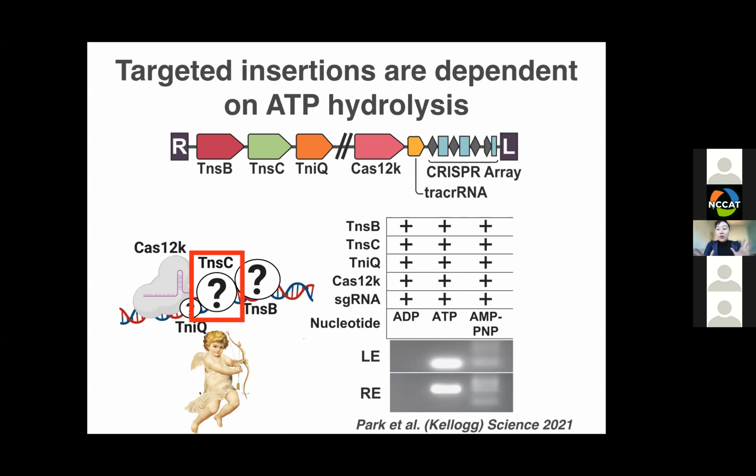So of course, as you know, because you're at this webinar, I focus on Cryo-EM. And today I'm going to be going through a lot of the methodological details and the challenges that we encountered throughout our structural studies, because that did not make it into the paper we eventually published.